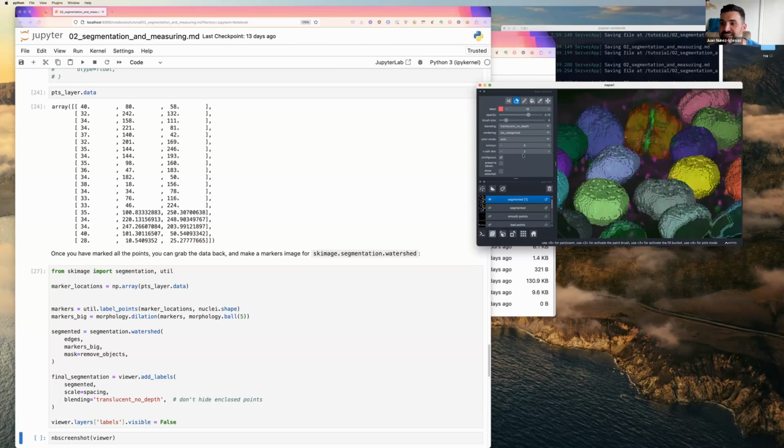That makes sense. And now I can fill that. Oh, I see, it only did one slice because I set the edit dimensions to 2. So let's change it to 3. And now fill. Okay, so that's separated that one nucleus. And we can do the same thing in the other one, especially now that we know what's going on.